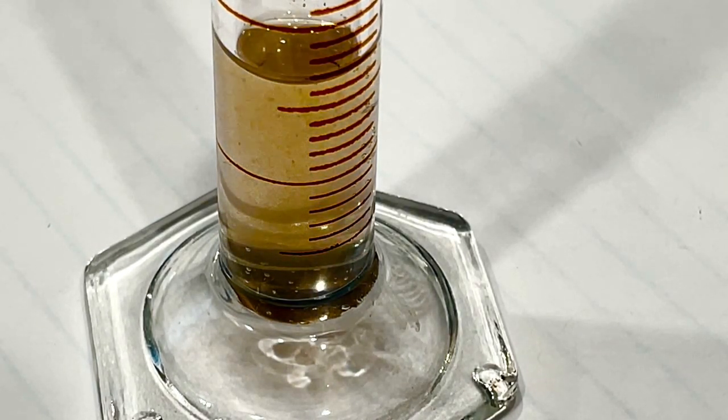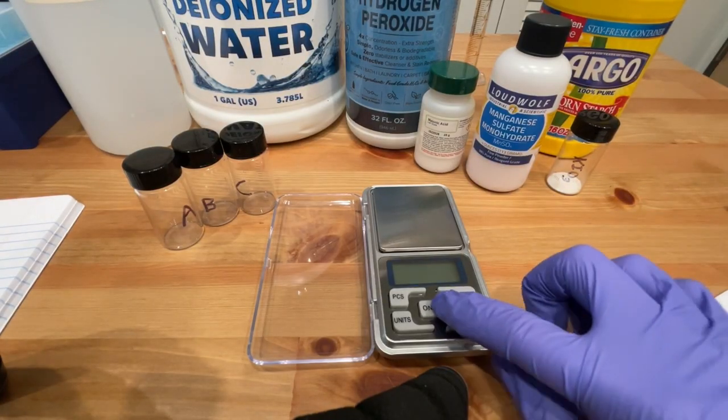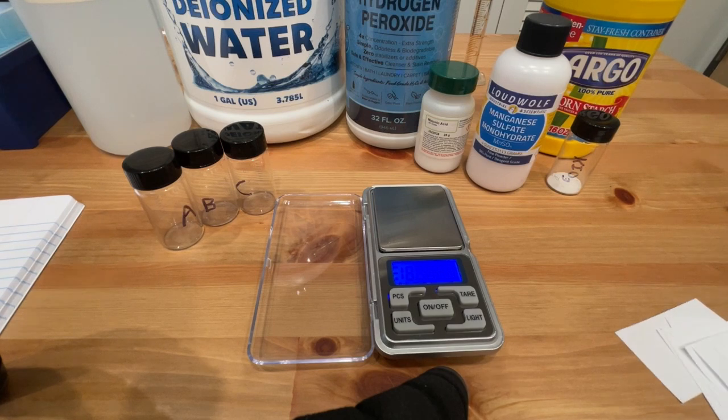In order to carry out this reaction, 3 mixtures are needed in equal amounts. 3 vials were labeled A, B, and C to hold these mixtures. Then I decided to add all the dry ingredients to the vials first.